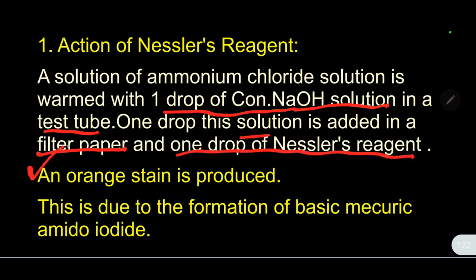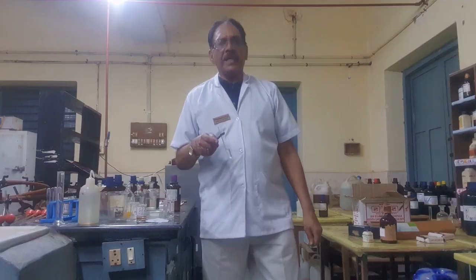On the paper, an orange stain is produced. This is the confirmatory test for ammonia. This is due to the formation of basic mercuric amido iodide.